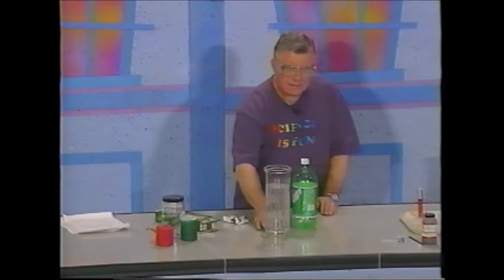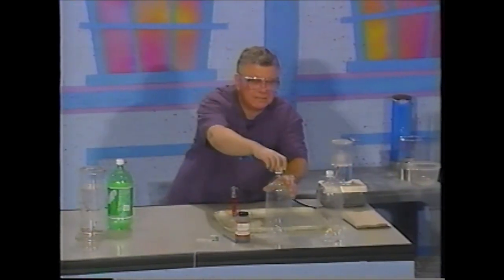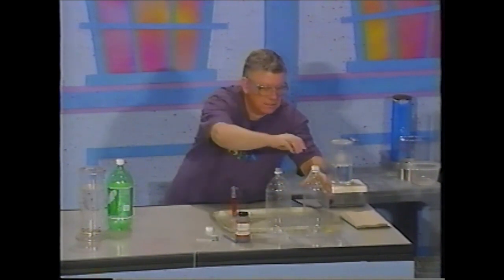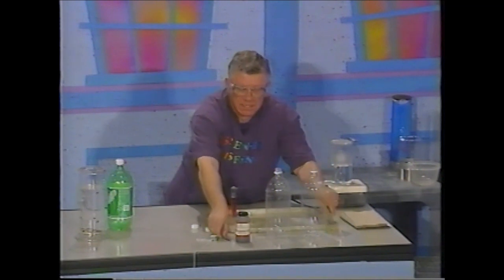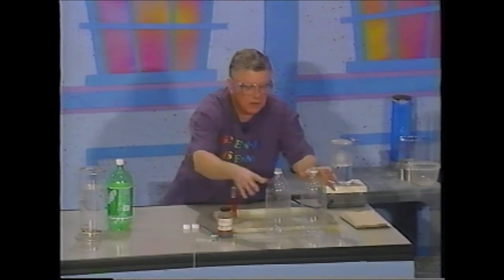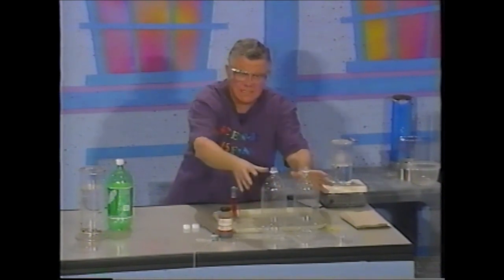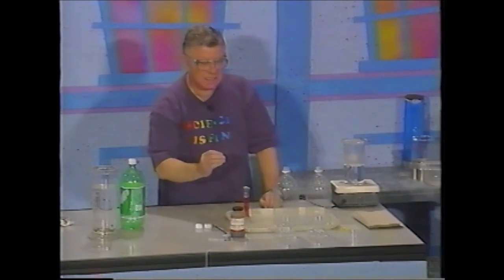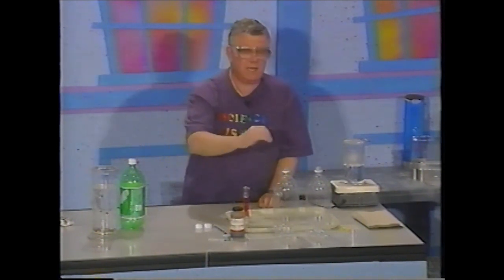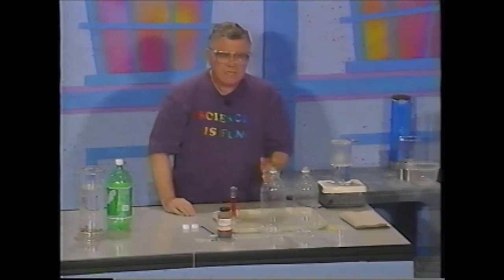This experiment had carbon dioxide in it. Now I'm going to do a different experiment over here using these plastic bottles. These two plastic bottles have at the bottom a small amount of a clear and colorless liquid. I will tell you what this liquid is. It's called hydrogen peroxide. This is 30% hydrogen peroxide, very concentrated hydrogen peroxide.